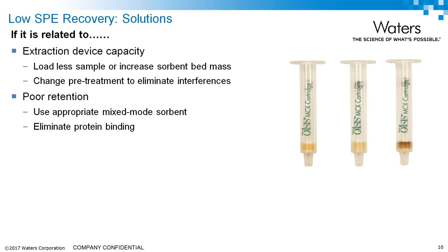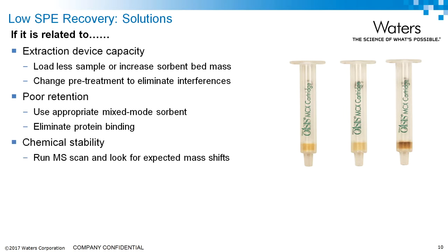If you have poor retention, we talked about the value of binding by ion exchange, both for specificity and for very polar compounds. If you charge the analytes upon loading and choose the correct mixed-mode sorbent, they will bind by ion exchange immediately, which is a very strong binding mechanism. Another possibility for poor retention is that analytes are actually bound to plasma proteins and pass right through on the load step — in that case, you'd want to eliminate protein binding.